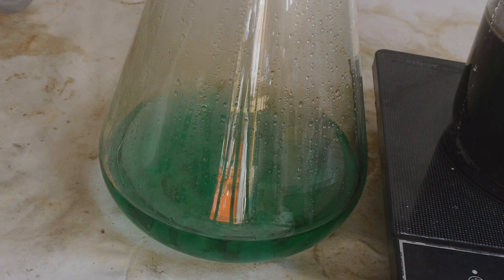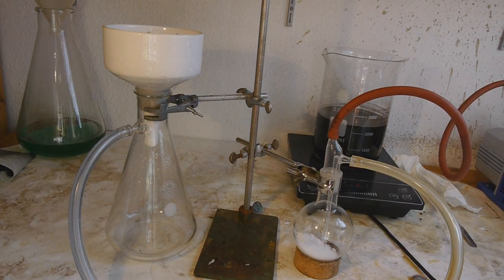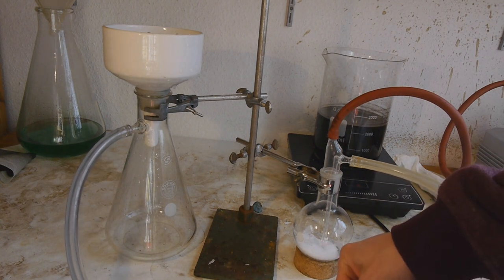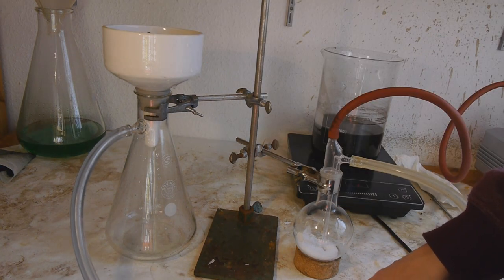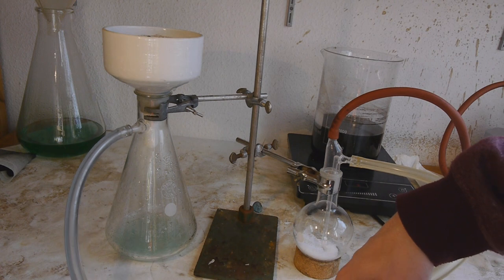Seeing that I still have like 10 liters to go, I think we are going to use vacuum filtration, which should be a lot faster. Vacuum filtration is set up. Now let's see if this works. This is looking great. Looks like this is working amazing.